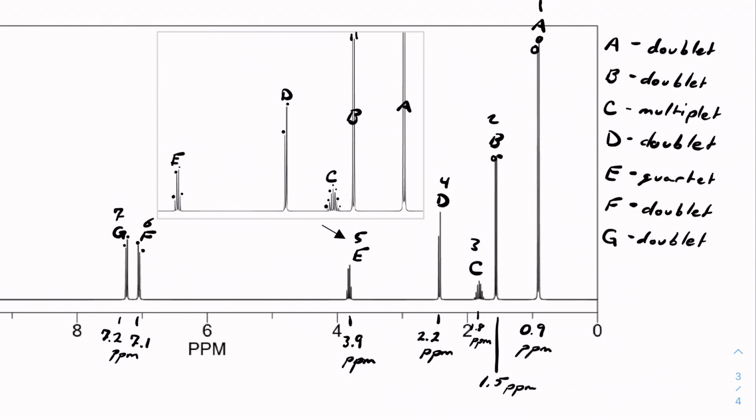So then from there, we're going to want to look a little bit more at what we know about doublets, what we know about multiplets, and what that signals for where things are going to be oriented within a molecule. And I am just pulling up a chart for proton NMR to help me work my way through this. And that's totally okay to do because there's a lot to remember.